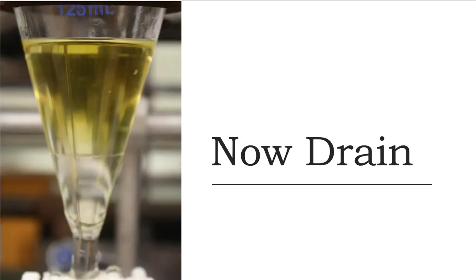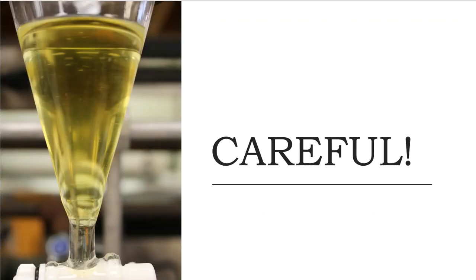All right, so after I wait for a couple of minutes, I'm now going to be ready to drain it. And once again, I want to be very careful. So as you can see, I'm slowly draining, and down here at the very bottom, I am getting close to the point at which the layers have separated. Also notice that as this tapers off, this golden color that's up here at the top is going to get lighter and lighter because there's less of that solution, and it's going to be maybe a little bit harder for me to distinguish the difference between the two layers.